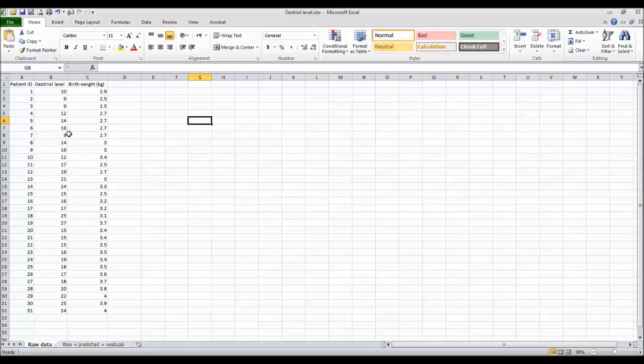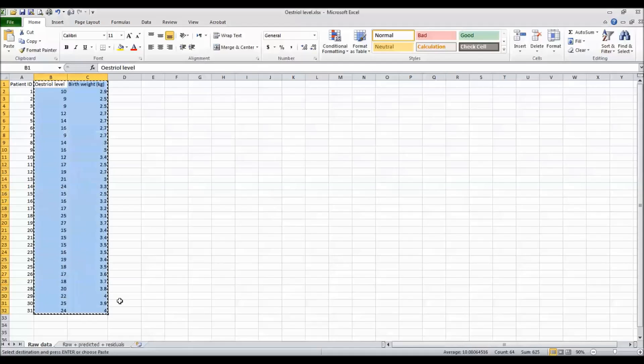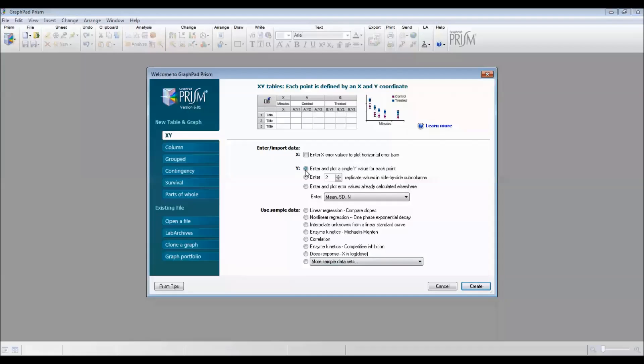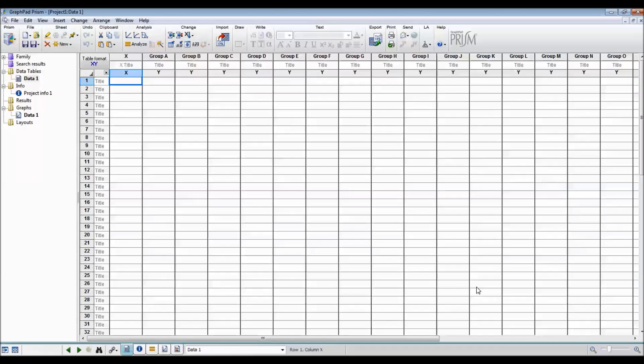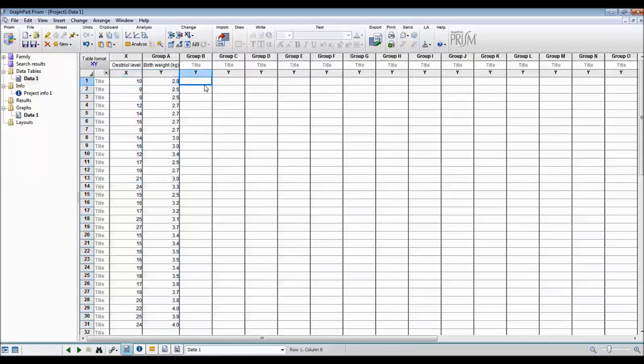So I'll copy the oestral level and birth weight and then I'll go to GraphPad. So now I'm on GraphPad and the type of table and graph I want is an XY and I'm going to be entering in data and I am entering and plotting a single Y value for each point. So then I say create and from here I can paste in the data set and you can see that data from Excel has now been put into GraphPad.